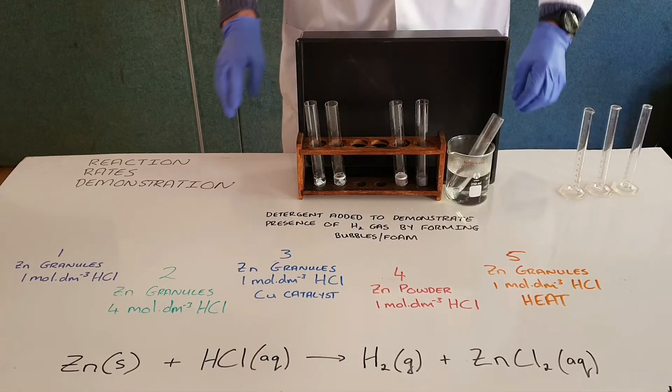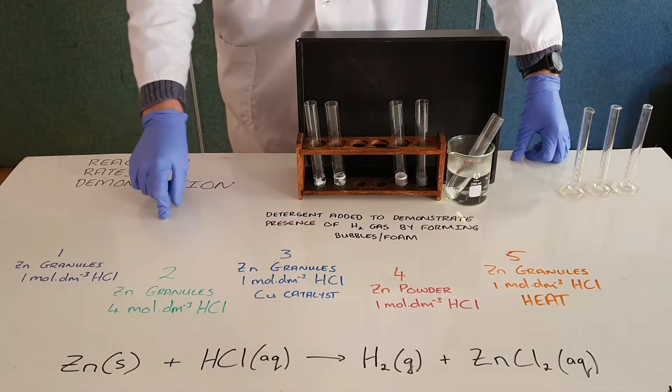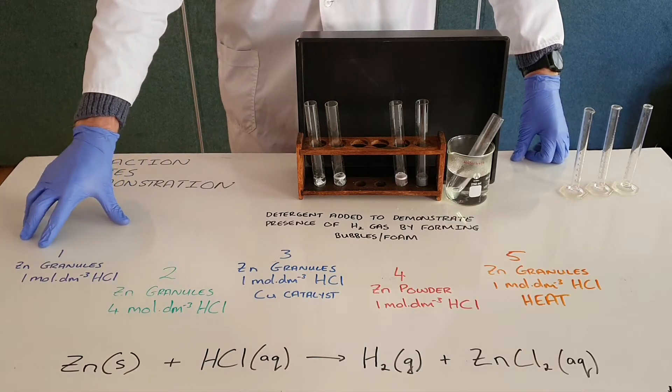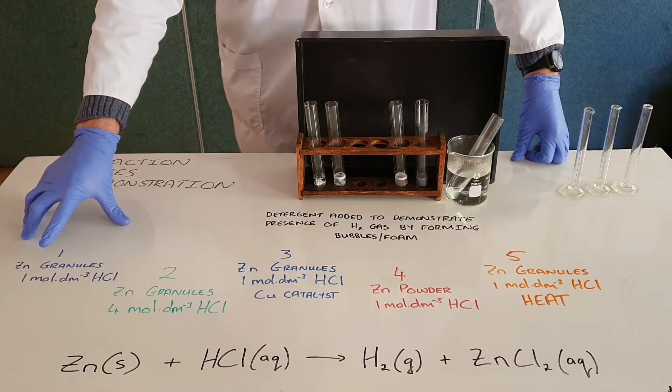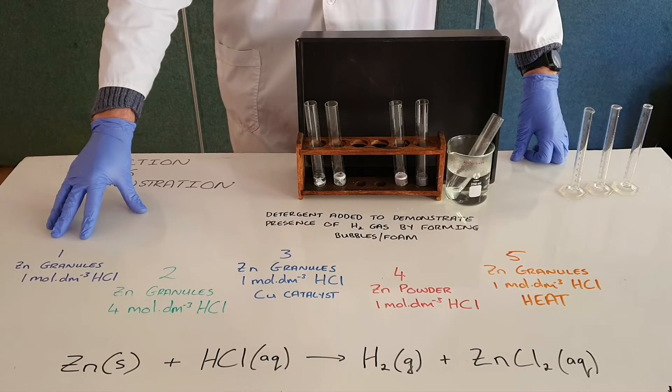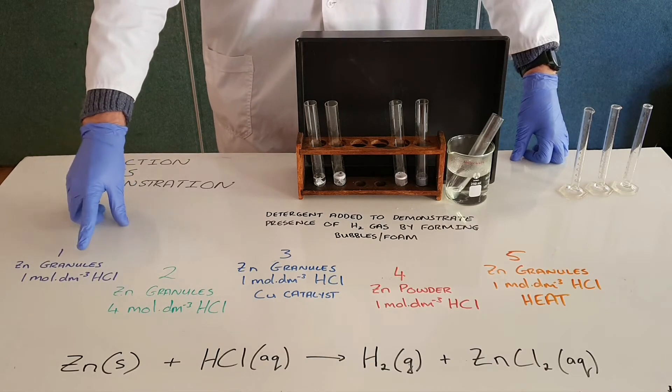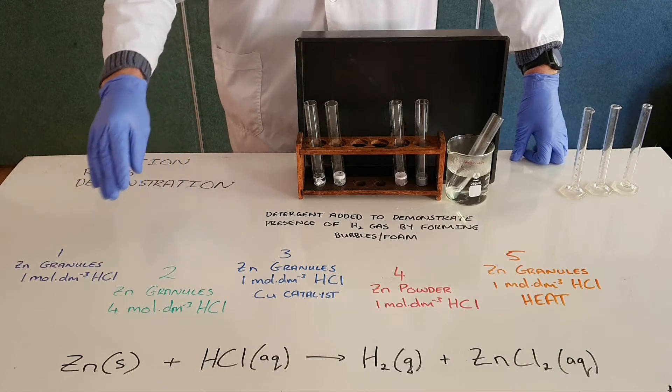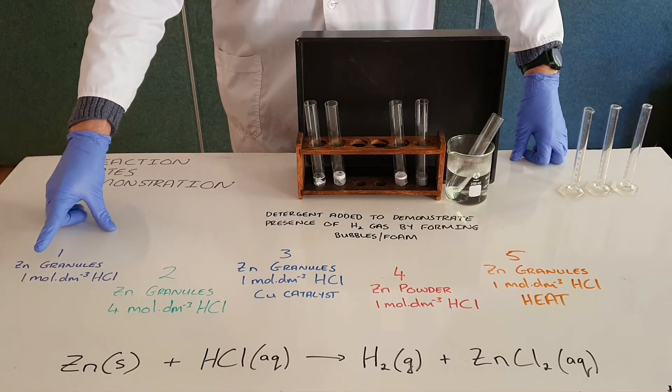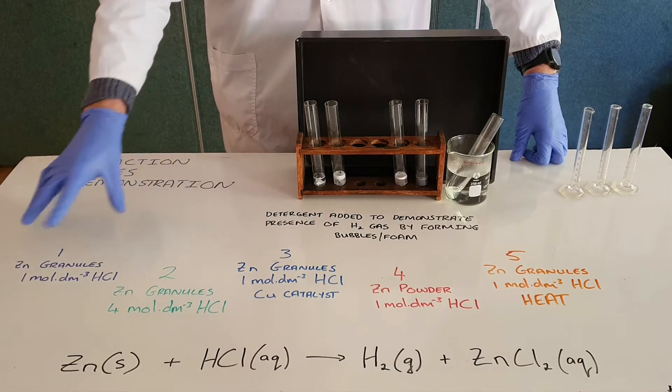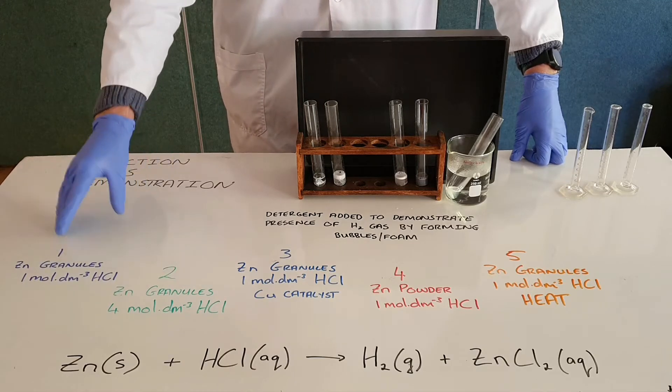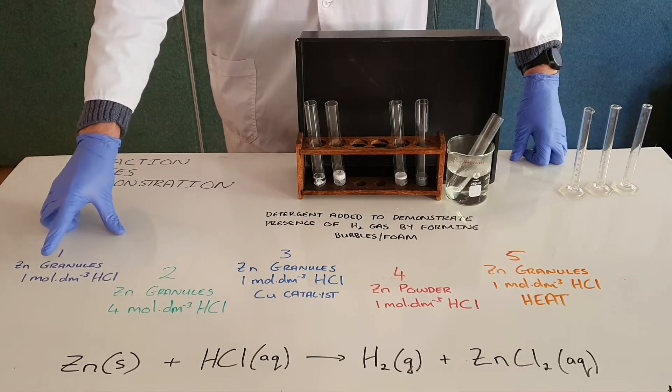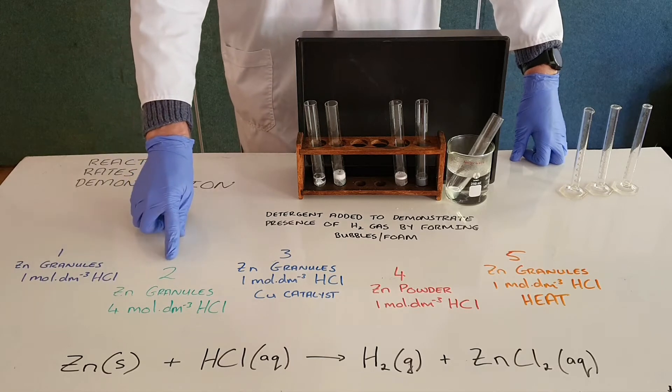Now what we would expect to see is that our first reaction here, zinc granules with one molar hydrochloric acid, we expect this to be our control reaction. As you can see there are granules in all but one of the reactions and there's one molar hydrochloric acid in all but one of these reactions, so this should be a control and we can monitor how much foam is formed in this reaction.